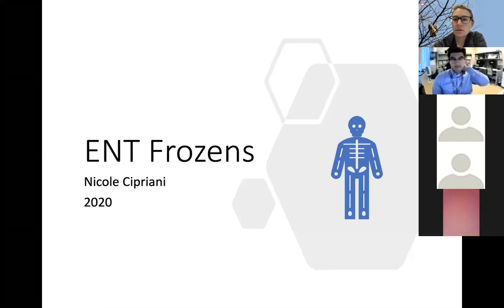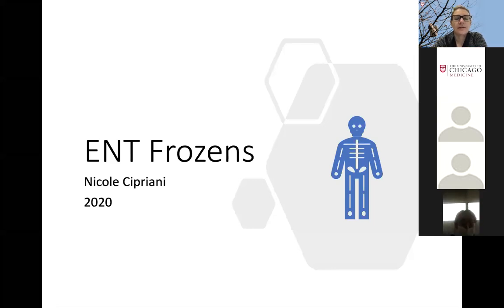All right, so to continue on our ENT journey, I thought I would talk about how to handle not only grossly what to do about these ENT frozen specimens, but also how to think about them microscopically and how to put them all together into the context of a sign-out synoptic report, because there has been some confusion lately about how to handle them and how to think about them, not only from you guys, but from some of the faculty as well.